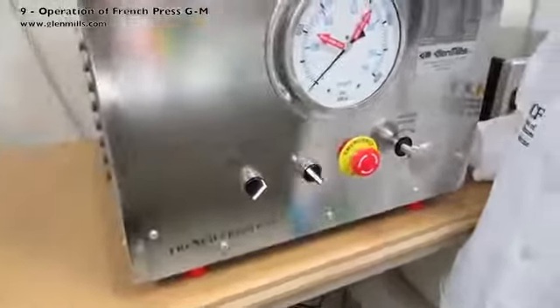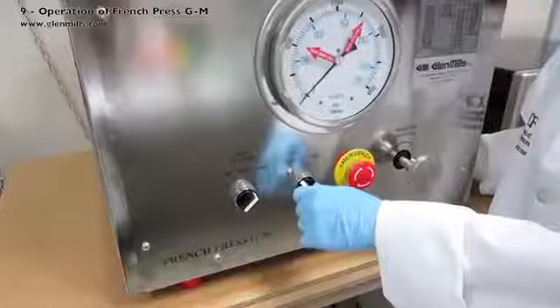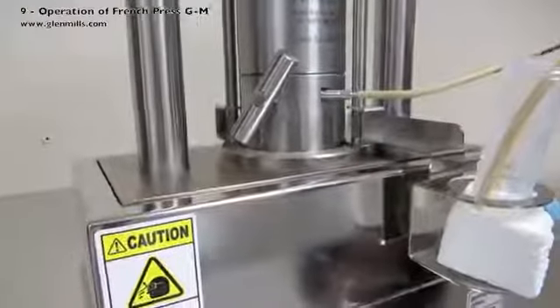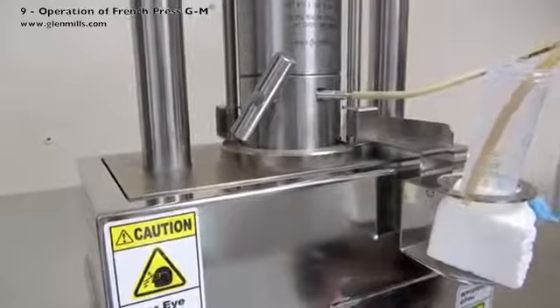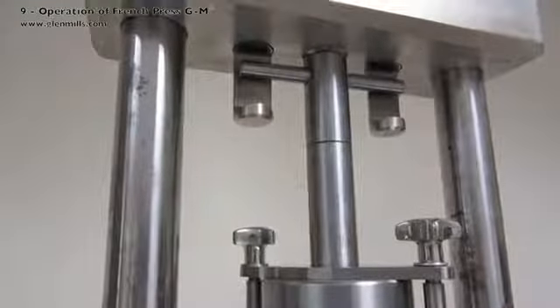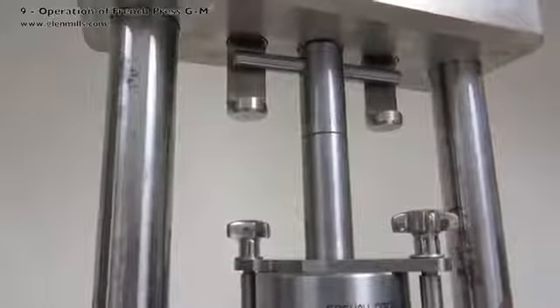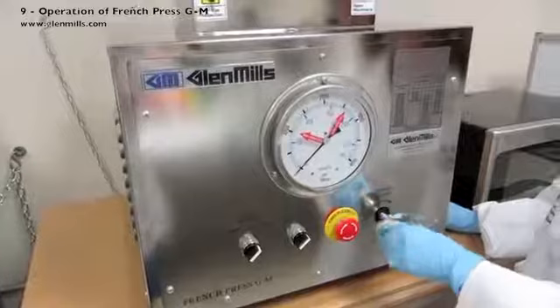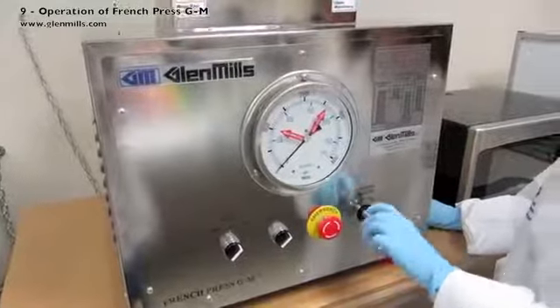Set the pause/run switch to run. You will see the bottom platen moves everything upwards. Check that the piston top is in the recess at the top platen.